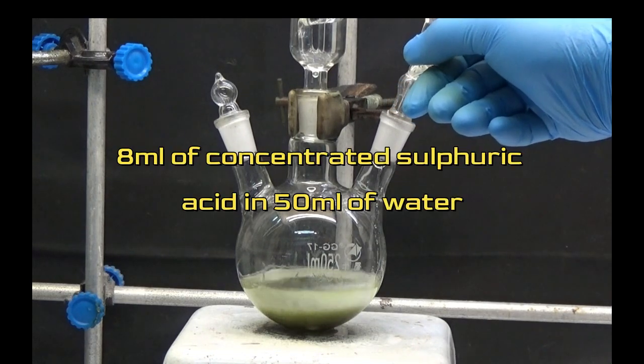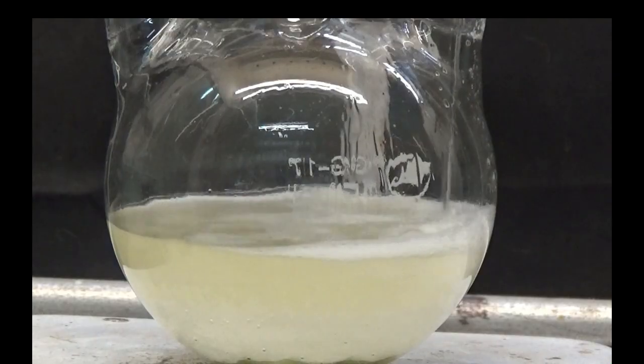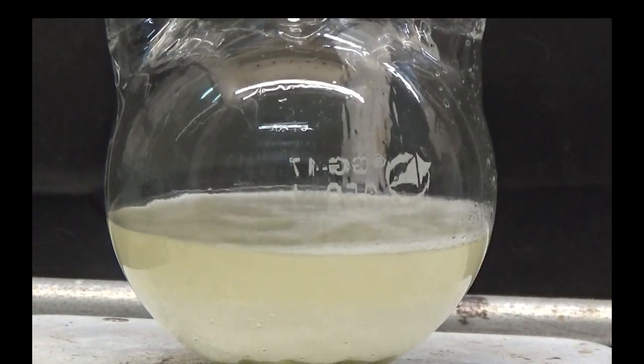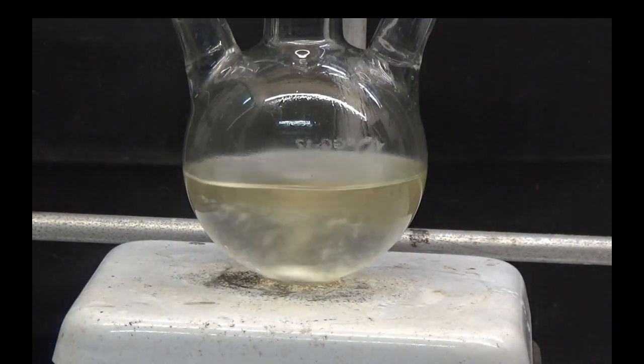Add solution of 8 milliliters of concentrated sulfuric acid in 50 milliliters water stirring vigorously. It is to be observed how the green mass dissolves.